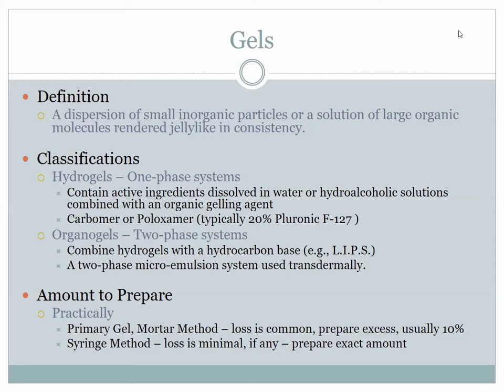All right, so let's move on to topical gels, because that is what you're going to be making today, a topical gel. All right, so a gel is a semi-solid, like a cream base or an ointment base. It's got some consistency to it, right? It's not a liquid, it's not a lotion. So it's got a jelly-like consistency is the best way to describe it. And you can put lots of molecules and drugs in this kind of jelly-like consistency.